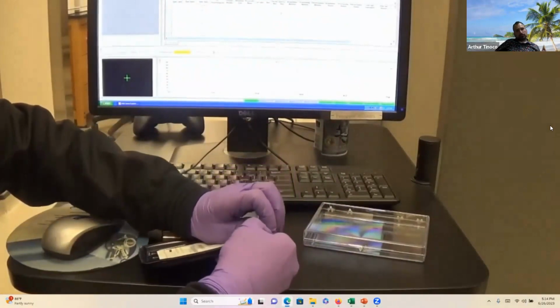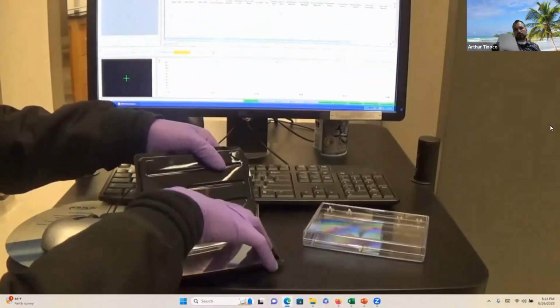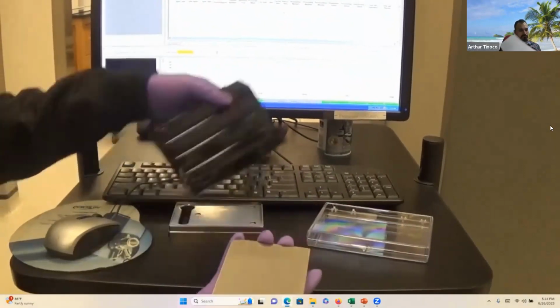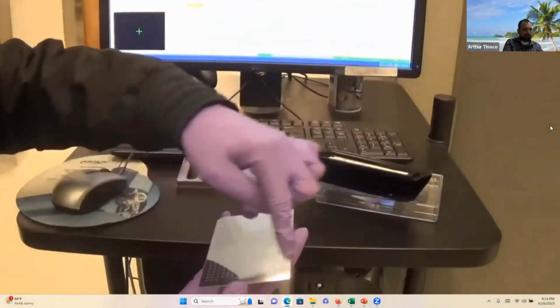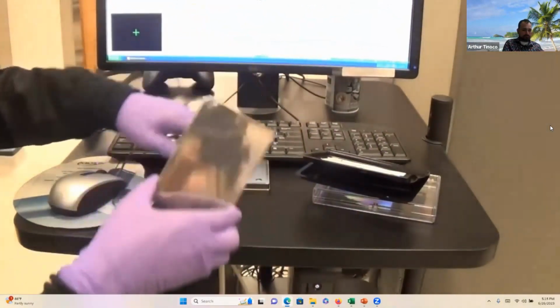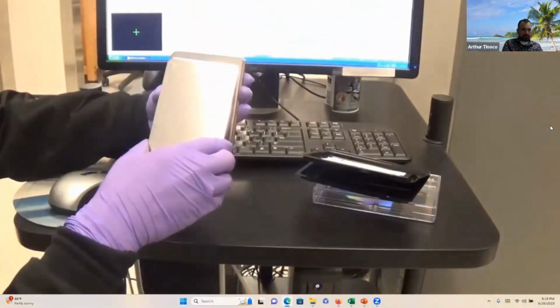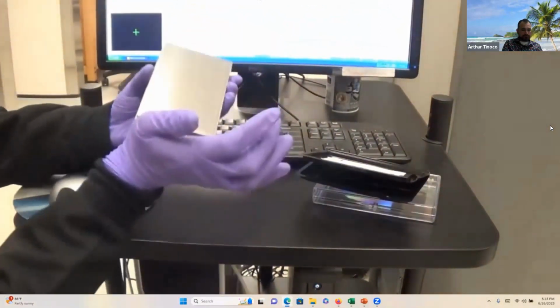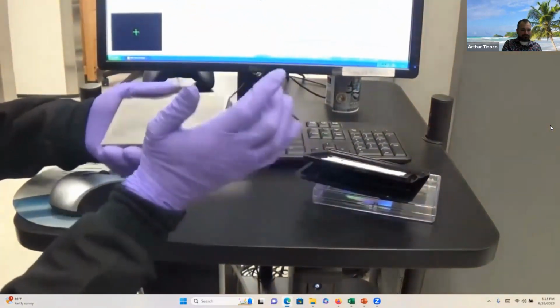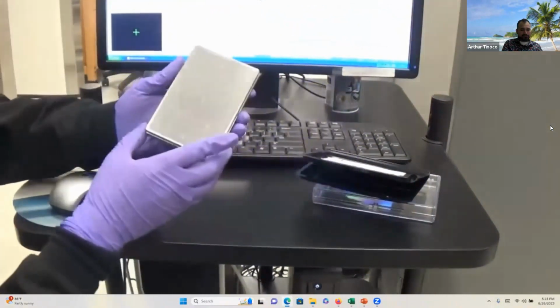When we open up a plate for the first time, it will be located in a plastic sleeve. We remove that plate, and as you'll see, it is rectangular. There is one corner that is indented, and that's intentional, so that it can be aligned to that spot in the insert. The insert is magnetic, so the plate will be held in place, and you tap on each side to make sure that the plate is locked in nicely.